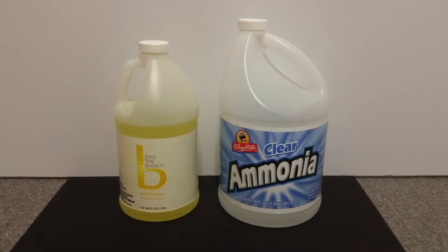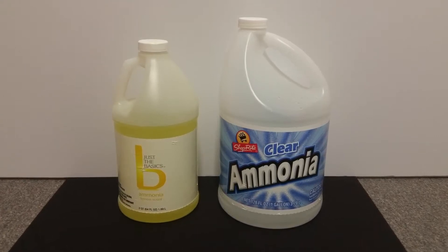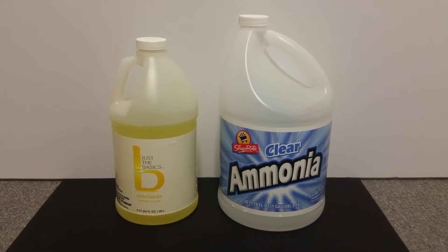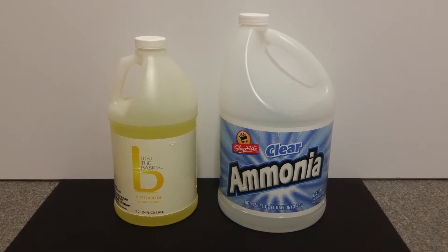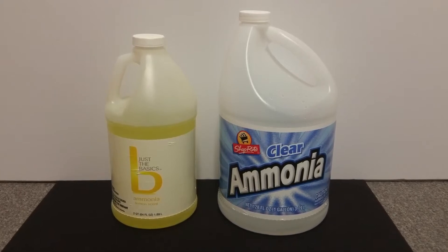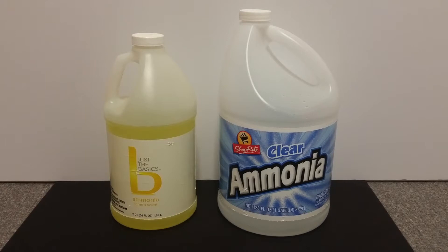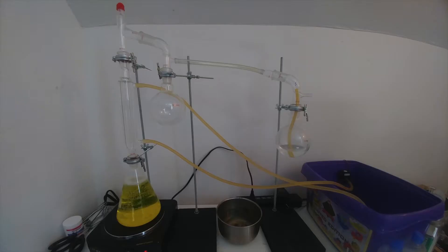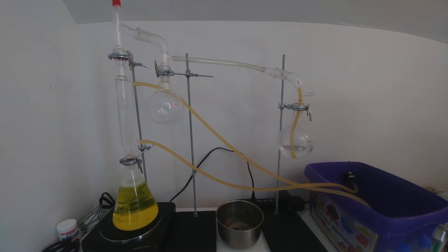Unfortunately, obtaining ammonium hydroxide isn't that easy for the amateur chemist, at least not in high concentrations. Most grocery stores sell dilute ammonium hydroxide ranging from 1% up to 10% concentration. However, laboratory-grade ammonium hydroxide is usually sold at anywhere from 28% to 30% concentration.